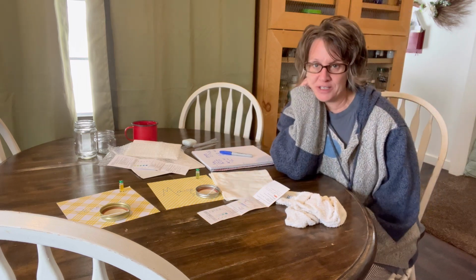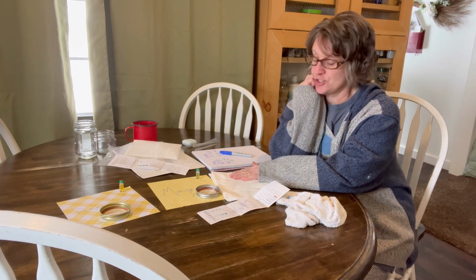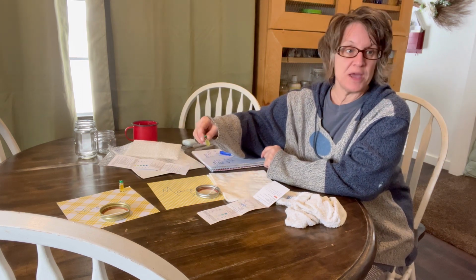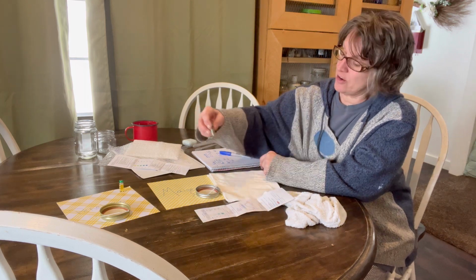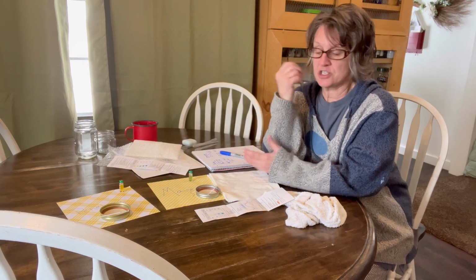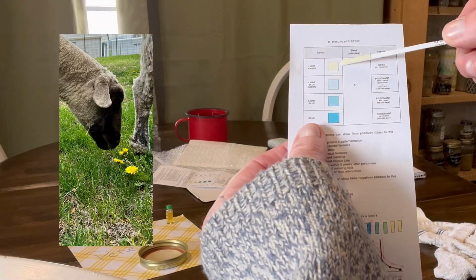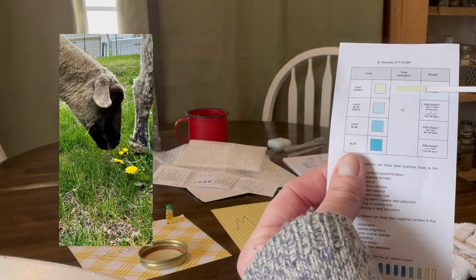At 12:32, I can look at Penelope's strip. So for Macy, these tests seem to be validating each other, that she is definitely pregnant. It has now been 15 minutes or more for this one, for the vial, and it's still showing pregnant. It hasn't changed any colors at all. All right, 12:32. It is now time to read Penelope's result. According to Penelope's test, she has another negative. So I don't think Penelope is going to have a baby.